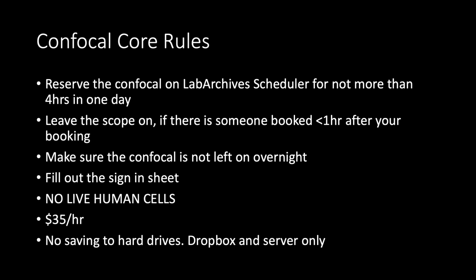Make sure you fill out the sign-in sheet for accountability and for billing. We do not have the biosafety certification for live human cells, so you cannot image live human cells on the microscope. You can image fixed human cells and live mice cells, but not live human cells. That requires a special biosafety certification. Using the scope is $35 an hour. You are billed for the first hour in its entirety, and then after that in 30-minute increments.